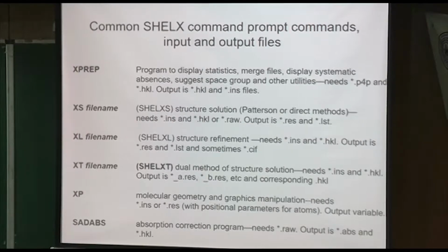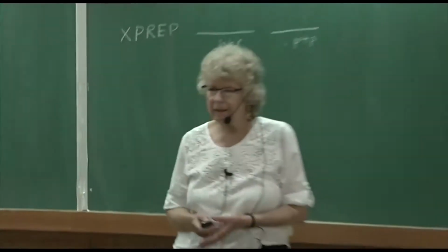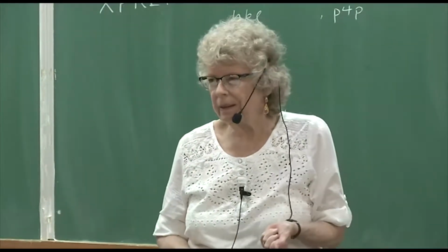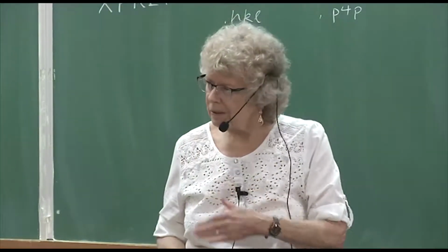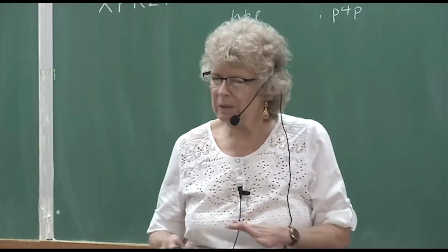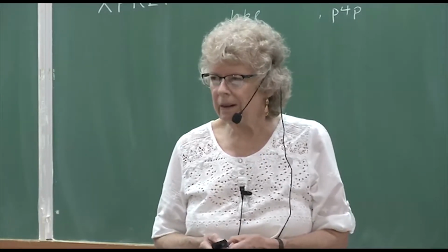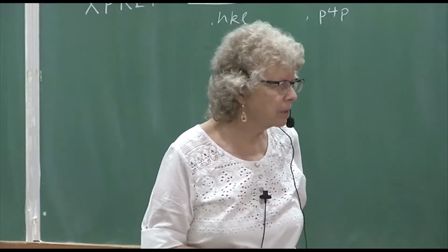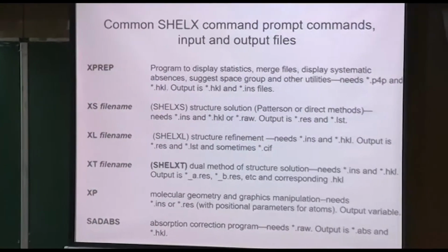One really good reason why you shouldn't is that the old versions like SHELX-L97 don't write a CIF that has the HKL file in it. The new versions will write you a CIF that has all of the data in it, the HKL, and that's what we need to archive nowadays. That's required by the journals, that you archive the data. So use SHELX-L 2017/1.